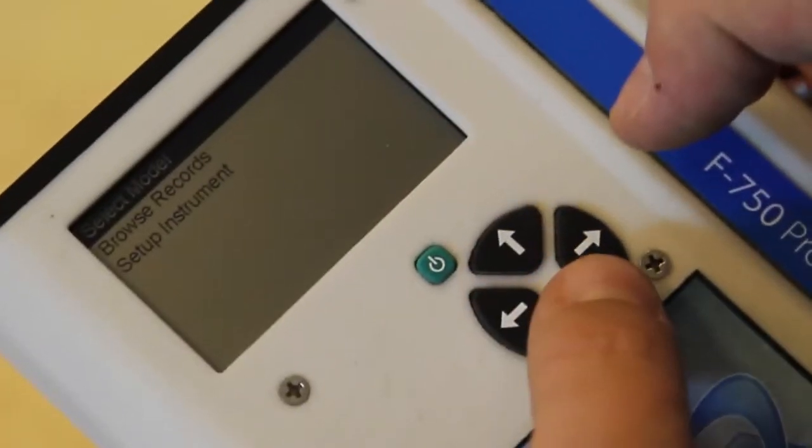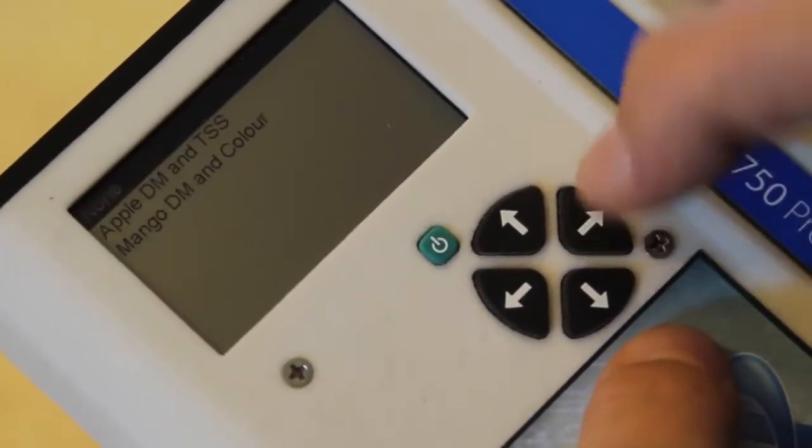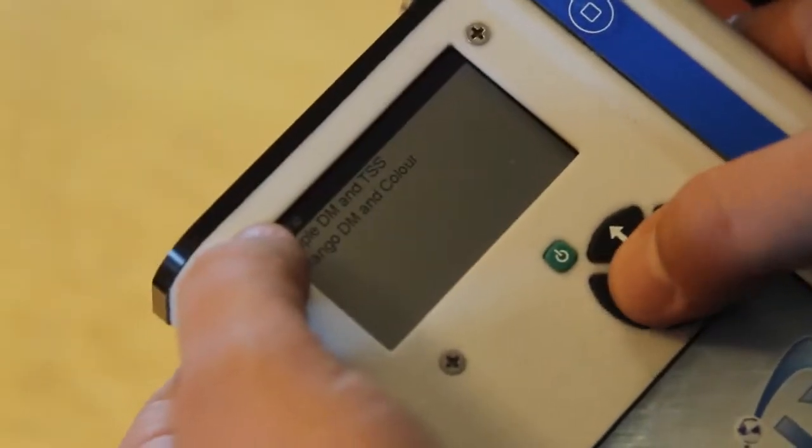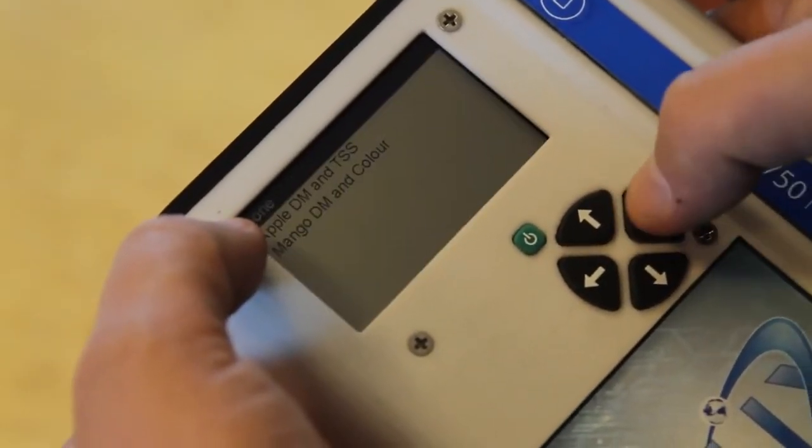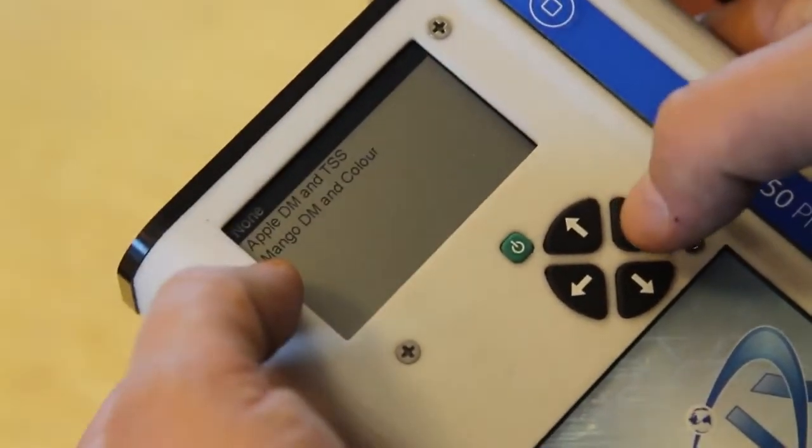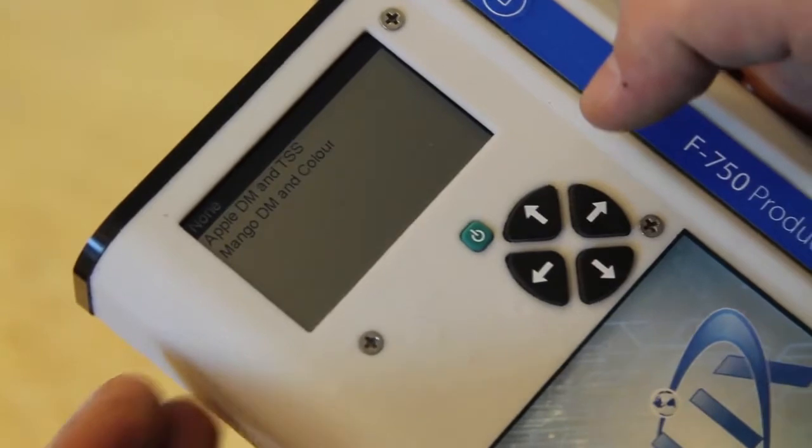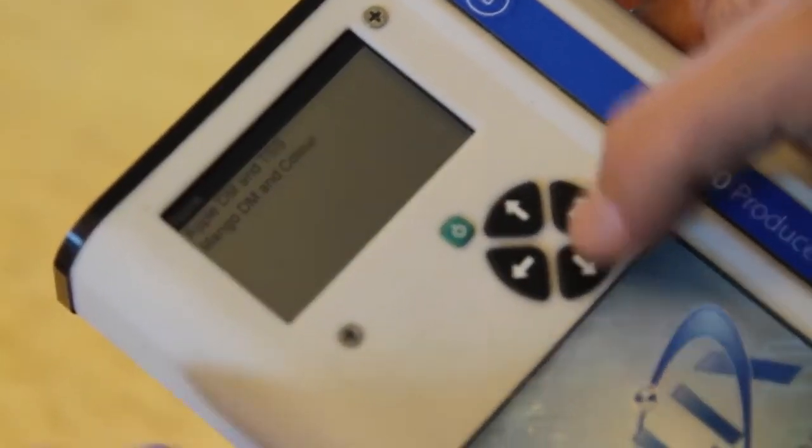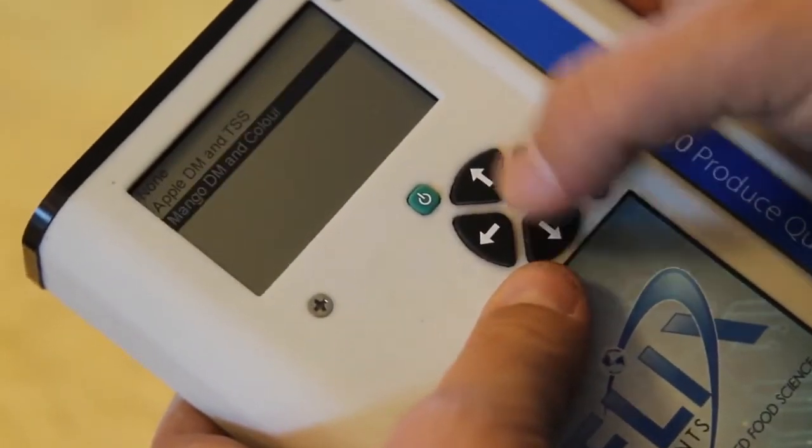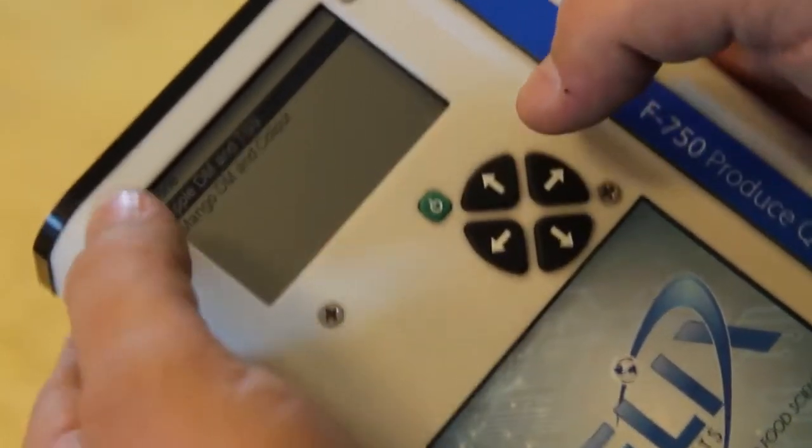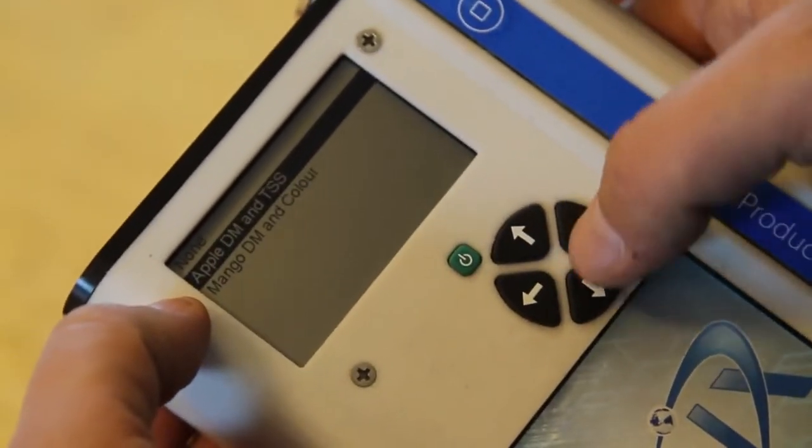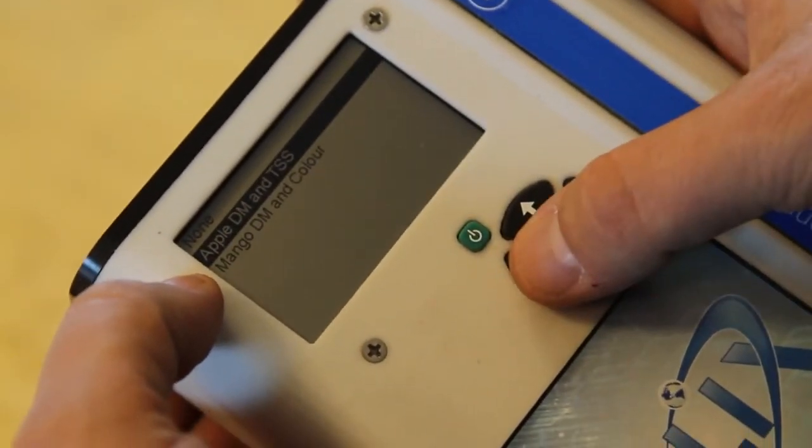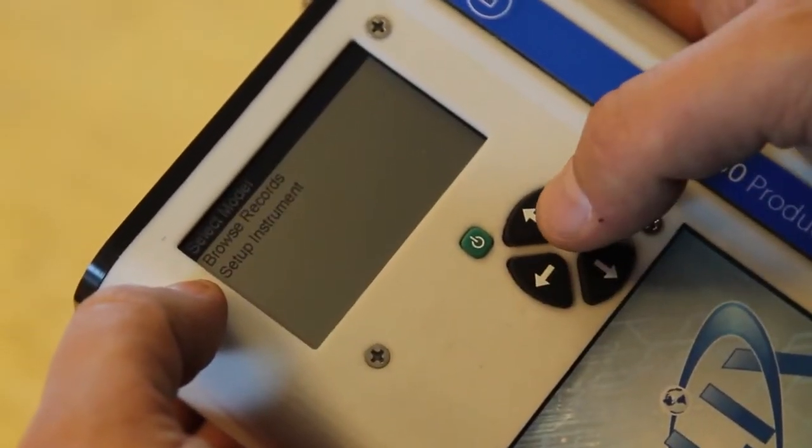We use the navigation keys to scroll right into menus. Under the select model menu, we have a list of the models that are pre-programmed on the F750. Using directional keys, we simply select the model that we'd like to use and then navigate back to the main menu.